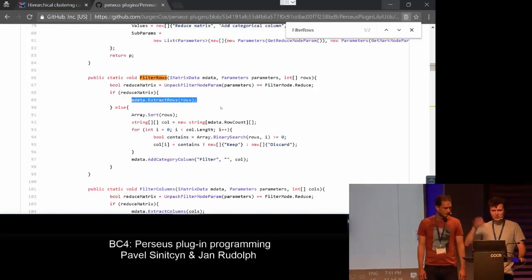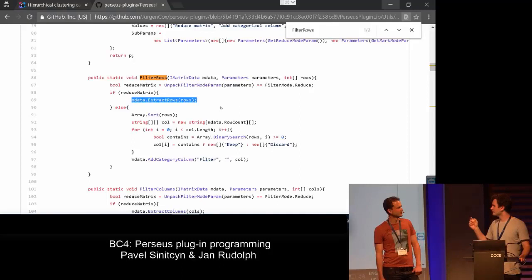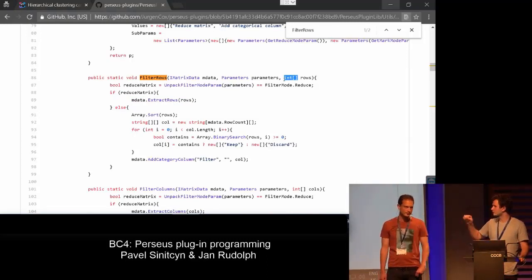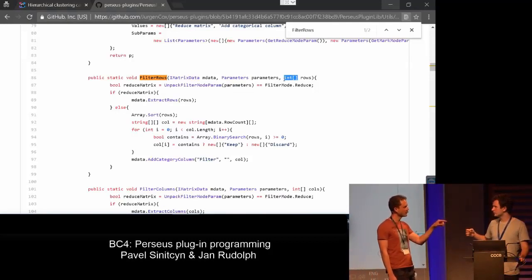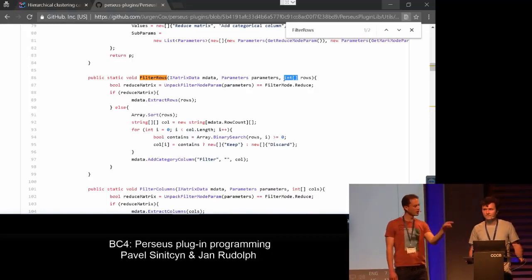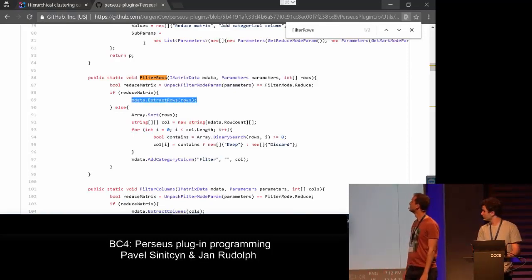It basically takes this matrix and extracts rows, and this function takes just one parameter, a set of integers, and this set of integers represents the indexes of the rows which you want to select. So I think in our plugin we also get this matrix data. Yeah. So maybe if we specify the rows and call this function, it will do exactly what we want. Yep. Right? Yeah, true.